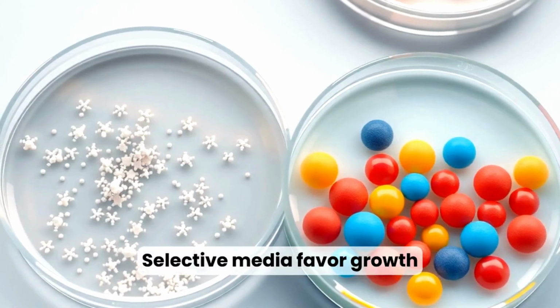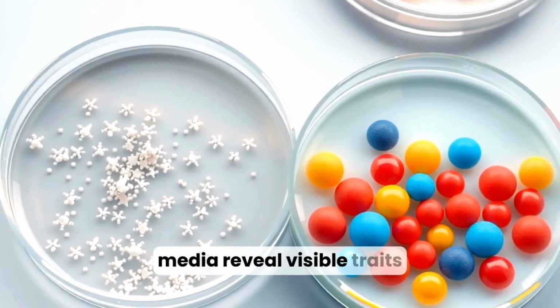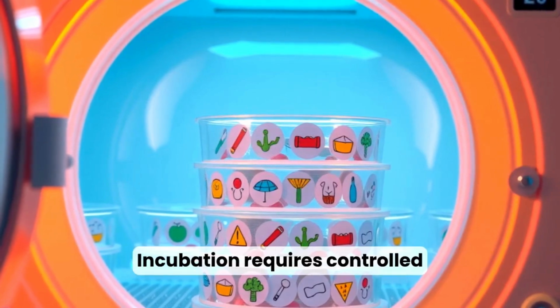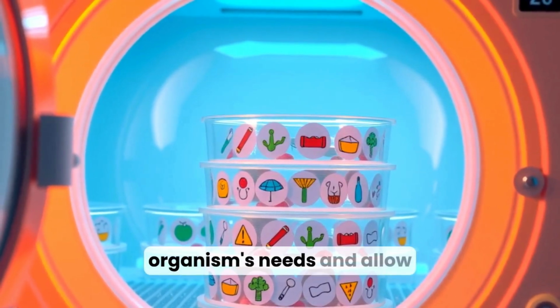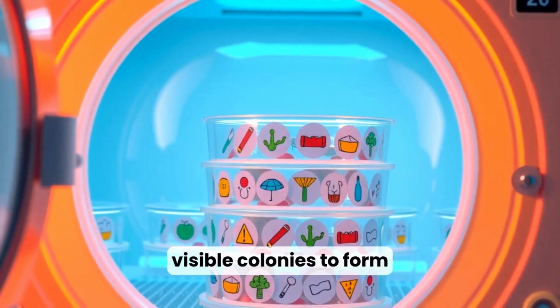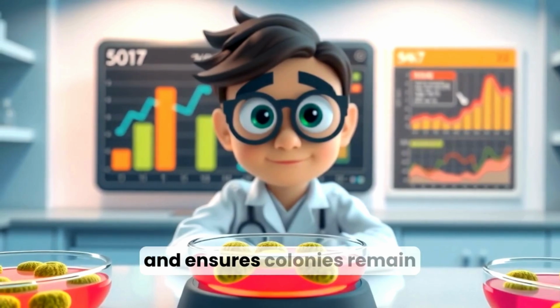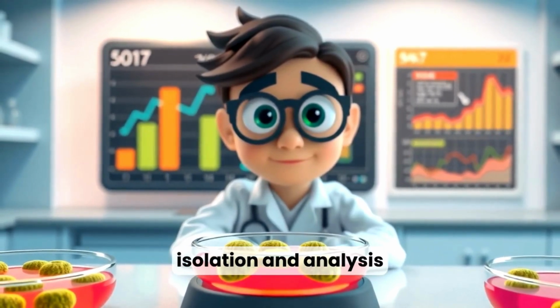Selective media favor growth of certain bacteria while inhibiting others. Differential media reveal visible traits like color changes. Incubation requires controlled temperature, time, and atmosphere to match the organism's needs and allow visible colonies to form. Monitoring growth prevents overgrowth or contamination and ensures colonies remain discrete for reliable isolation and analysis.